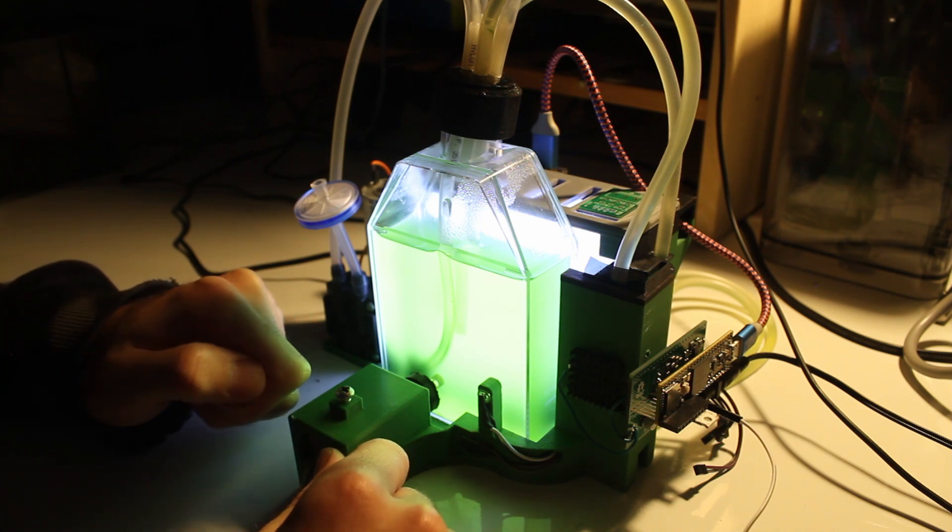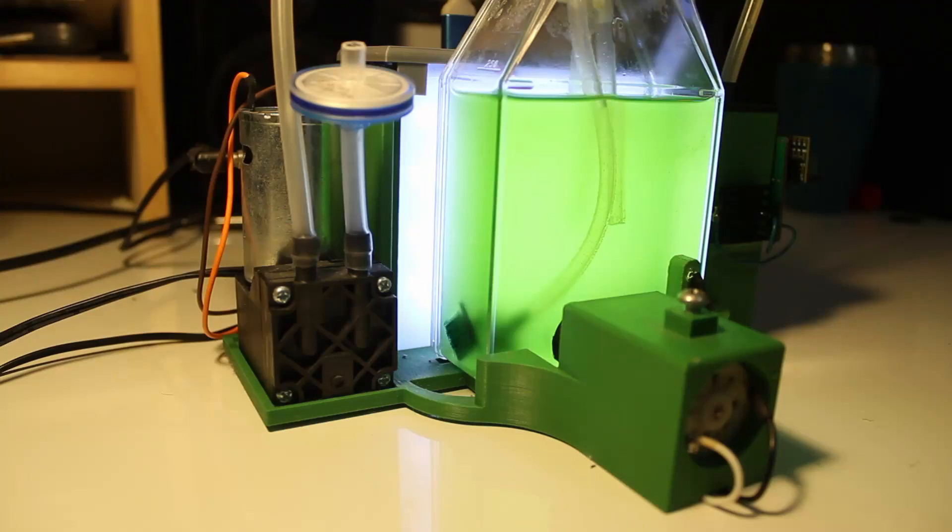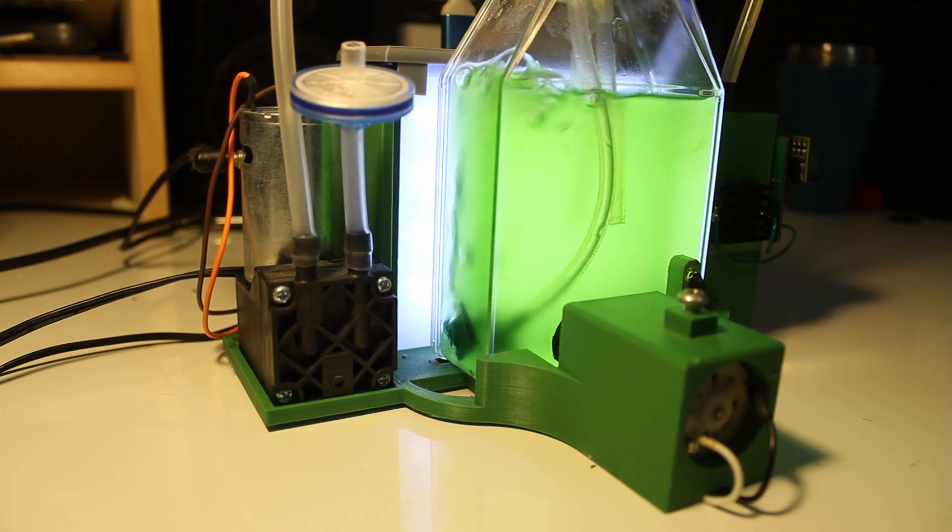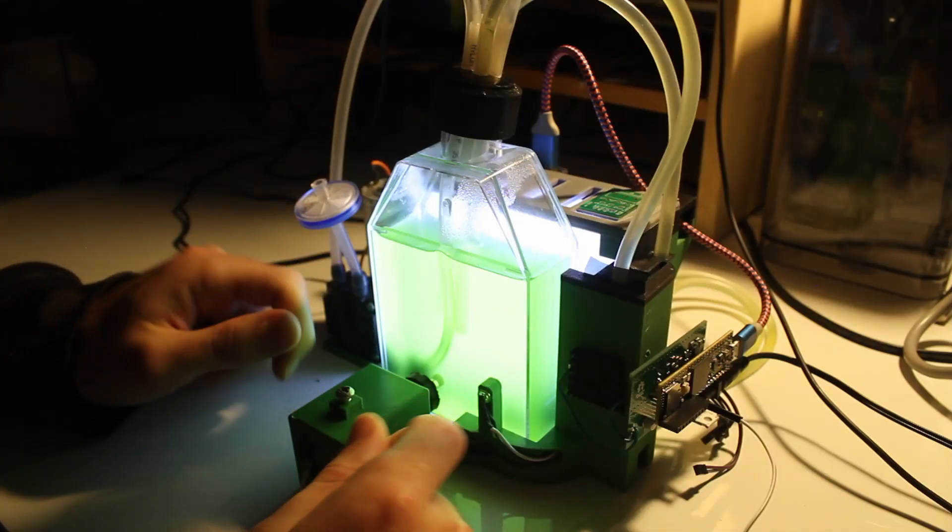An important part of cultivating microalgae is the addition of CO2 for photosynthesis. So on the left hand side here we have an air pump which basically pumps air into the main culture vessel at whatever intervals you want.